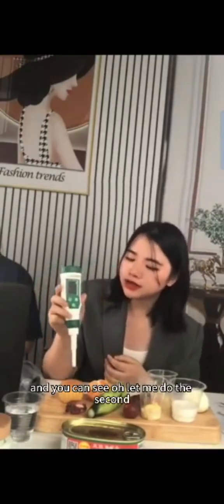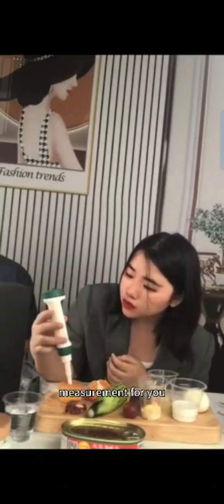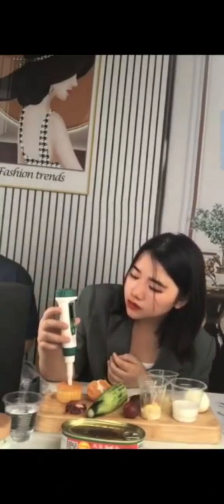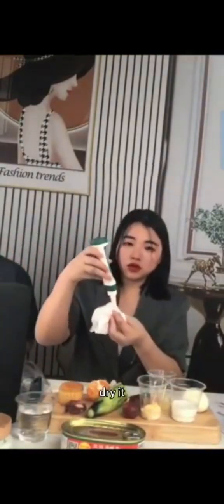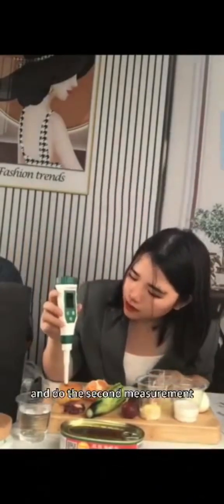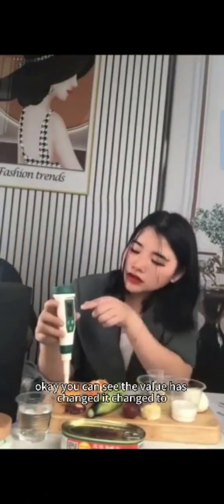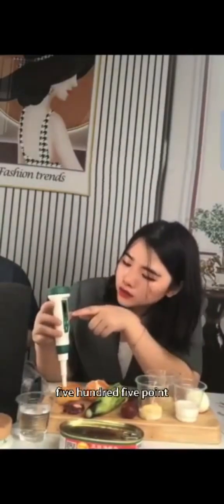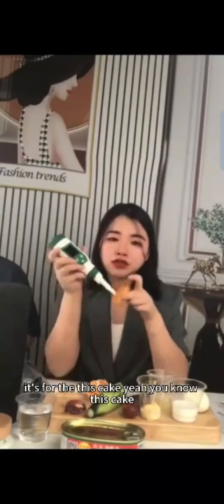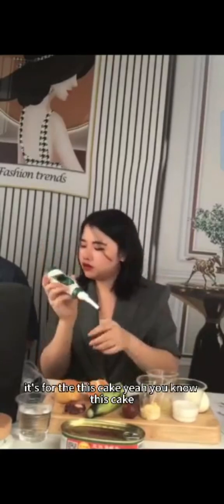Let me do the second measurement. After each measurement you need to put the probe in water to clean it, dry it, and then do the next measurement. You can see the value has changed — it's now 5.7 for this cake.